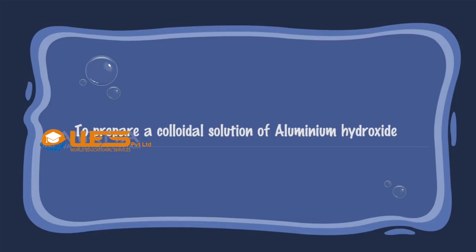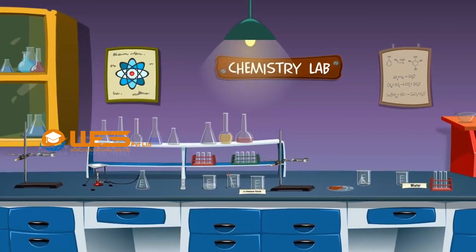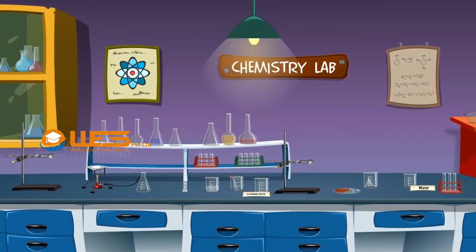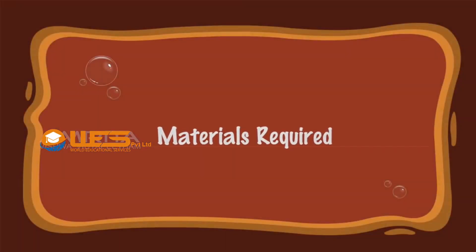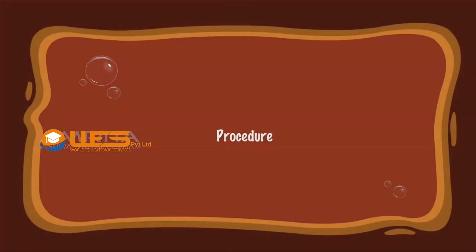Preparation of colloidal solution of aluminium hydroxide. Materials required: We require 2% solution of aluminium chloride, silver nitrate solution, dropper, glass rod, distilled water, beakers, wire gauze, tripod stand, Bunsen burner, funnel, filter paper, conical flask, parchment membrane, and iron stand with clamp.